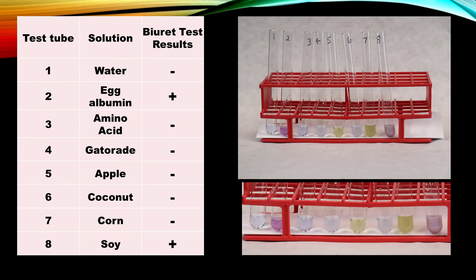Observe the test tubes over a white piece of paper. Blue solution indicates the absence of protein, or a negative result. Violet solution indicates the presence of protein, or a positive result. Our test today shows that egg albumin and soy milk test positive for protein.